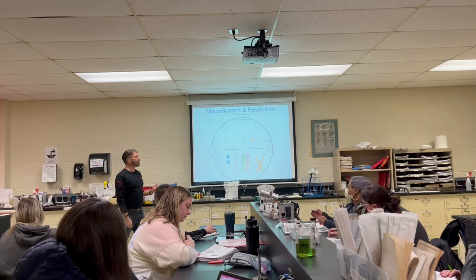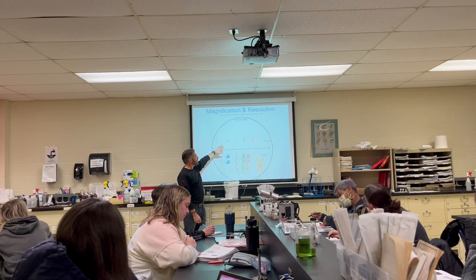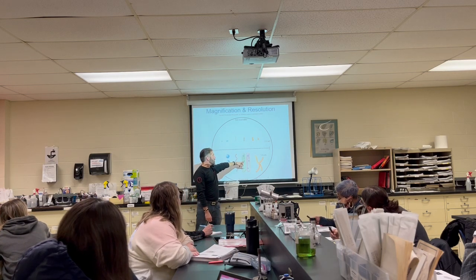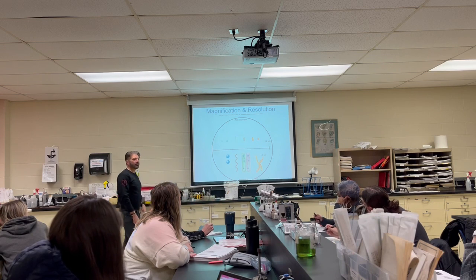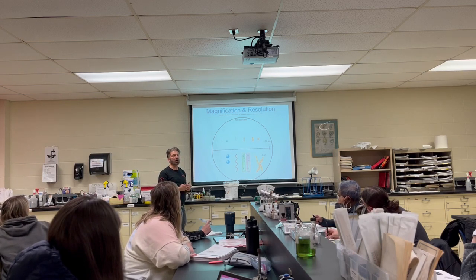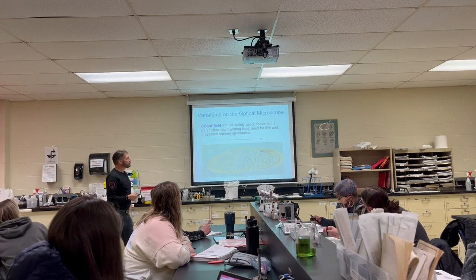So this is really telling you resolving power. Not a big deal, but if you look, these are a little bit harder to differentiate. Here, we can resolve these as two separate images. Okay. Does anybody here have trouble night driving? A little bit more difficult? And then let's make it dim, and let's throw a little rain so the street's wet. All right, so your resolving power goes way down, so you have an idea of what I'm talking about.